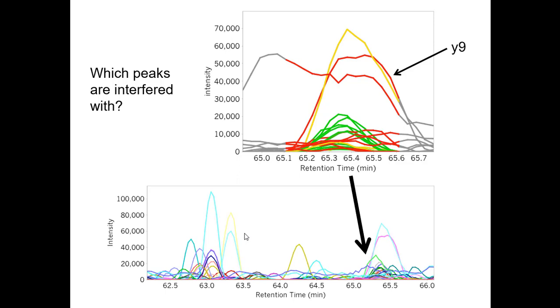You also get a lot of these red traces that really are representative of the background signal. These might just be from other peptides, or they're definitely from other peptides, but it's clear that they are not necessarily rising and falling with the shape of this peak. And a bunch of these particularly low MZ ions aren't necessarily reliable in terms of being able to make a call on them because they tend to co-occur with other peptides pretty frequently. Okay, so that's what's going on in this peptide here.